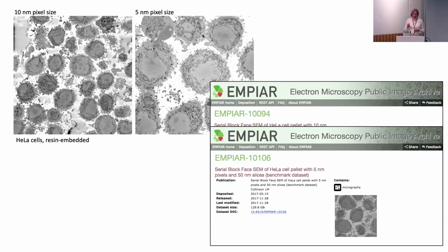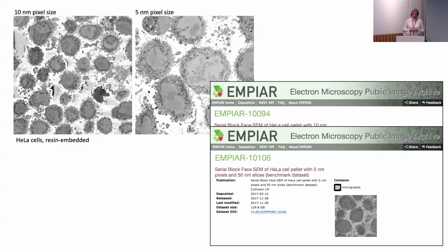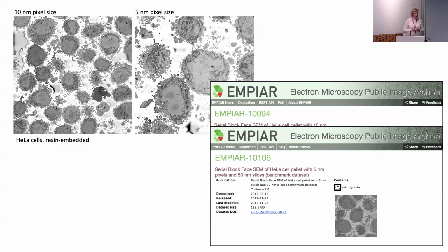So this is a really critical thing for our community, which I think would be a very tight connection with CCP-volumeEM so that we can get all of our data up, not just so that other scientists can mine the same data and maybe use control data sets for what they're doing, which will help with maybe animal reduction in animal use as well. But also so anyone involved in AI can access these data sets. And there's still a chronic shortage of ground truth annotations for people who are developing AI.